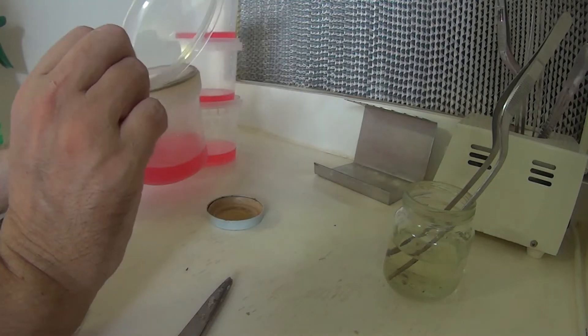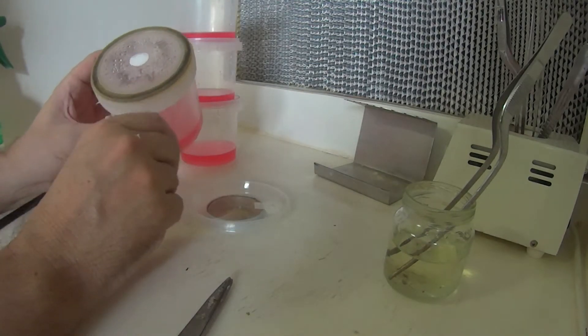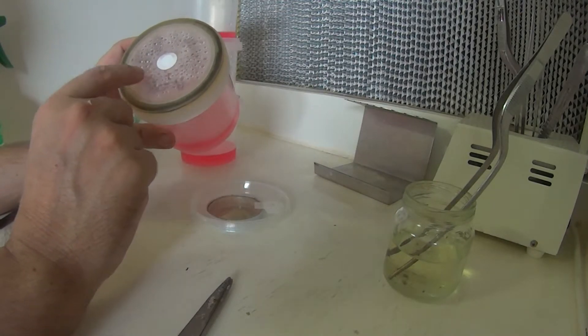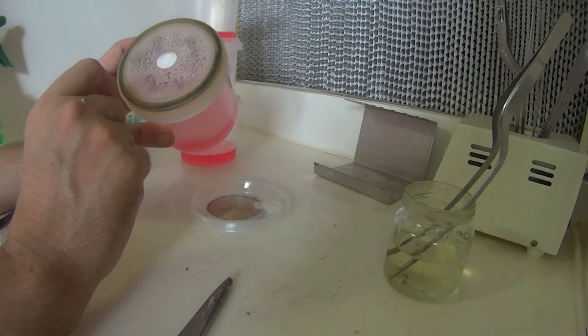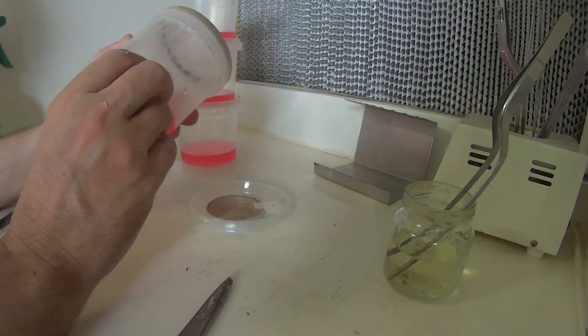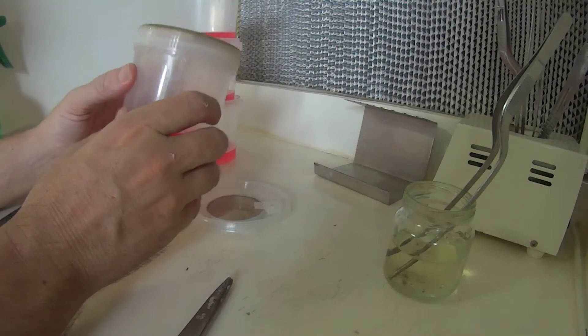Alright, I just showed you how I make my vent spots, or what to use for a vent spot, but this is just a quick look at the commercial type. They are fairly delicate, this type. If you scratch that too hard, you'd put a hole in it and tear it, and it's no good. It would allow contamination into your container, so I no longer buy these.